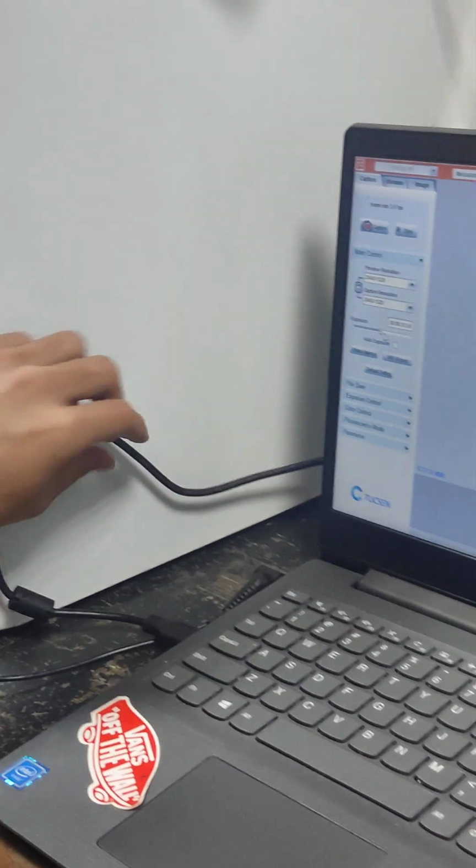Alright, let's see. First we haven't turned on the optical microscope, so let's do it now. The switch is on the bottom left. It's right there. Let me click it. You can see it right here. Yeah, there'll be a click.